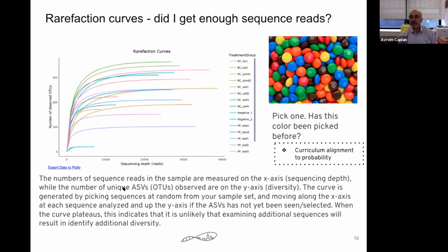Okay, there's another question from Karen Thickman. Is there a benefit to being further right on the curve? Once you've hit the plateau, there is no real benefit. There isn't a real downside to it either. It just means that you're maybe paying for sequencing that you don't actually need that much. Or a lot of this is computationally intensive, so you may not need to work with that many sequences. You could shrink your files and still get the information that you need.